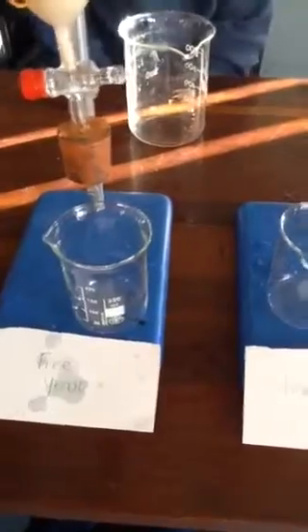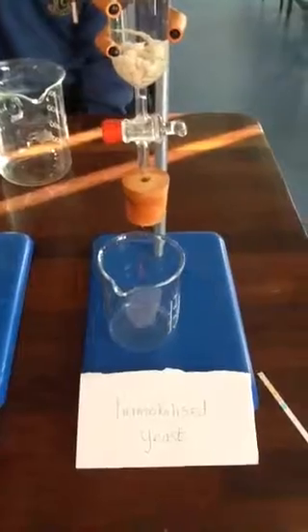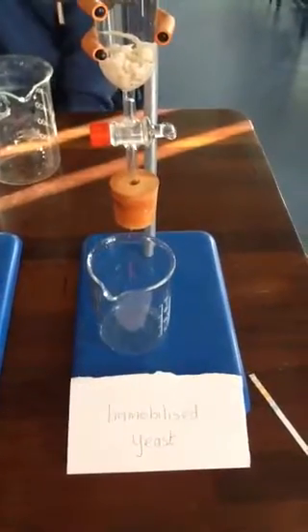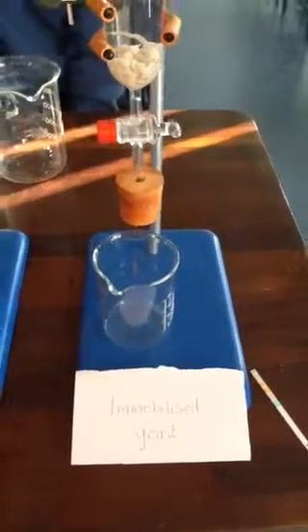So if the free yeast converts the sucrose to glucose more quickly, how come we're going to use immobilized yeast? What's the advantage of using immobilized yeast? Ellen, what's the advantage of using the immobilized yeast?